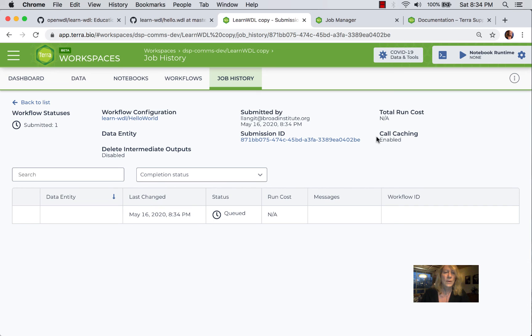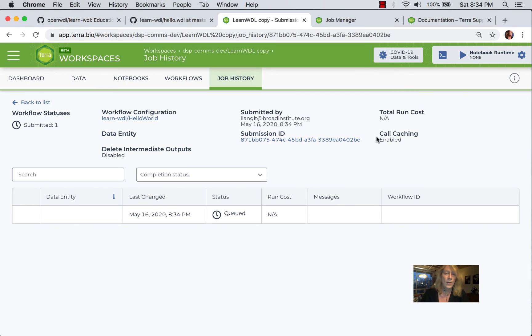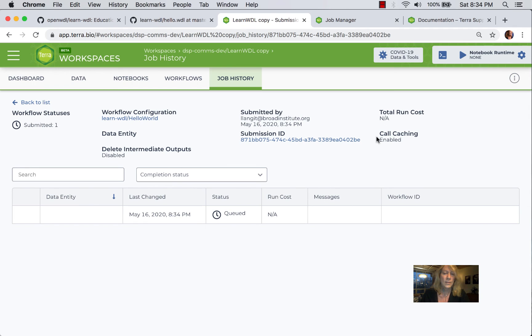And this will launch one analysis. And this takes us to our job history, which is an aggregator and a viewer of the log information, both the Cromwell log information we saw when we SSH'd, as well as some of the Google Life Sciences information.